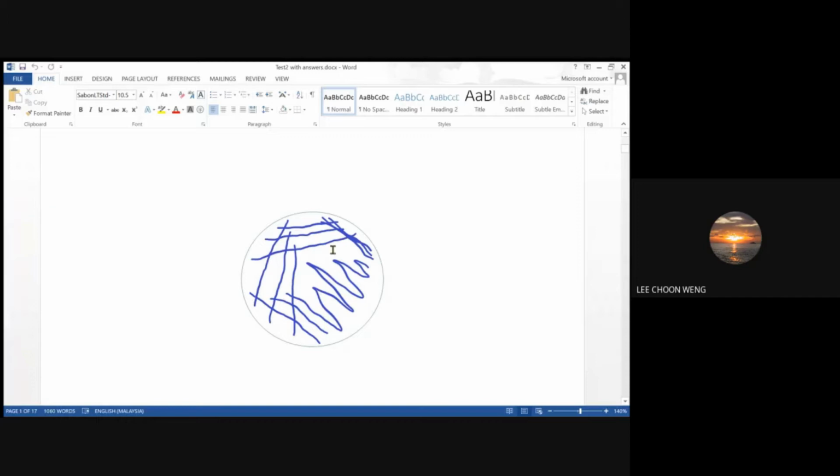So if you look at this pattern, first this is the dense streak. You get the bacteria growing, and then the streaking. And you can see here that I take less and less lines. Here I take 3 lines, 2 lines, 1 line. Because the main aim is to dilute, dilution streaking. So you need to reduce your amount of inoculum so that you get single colonies here.